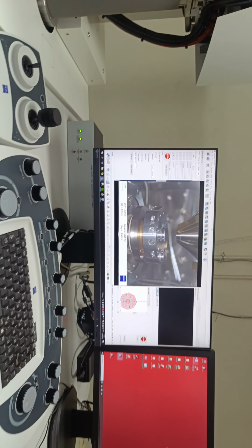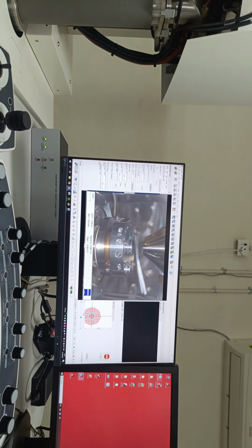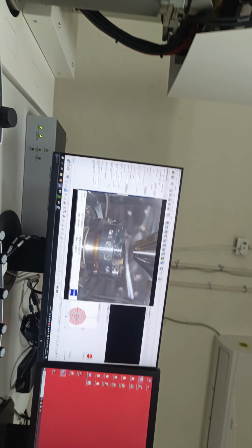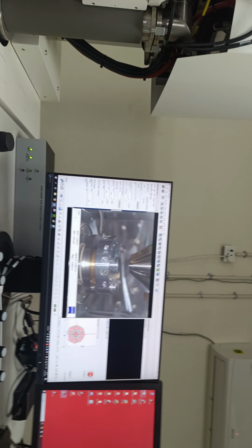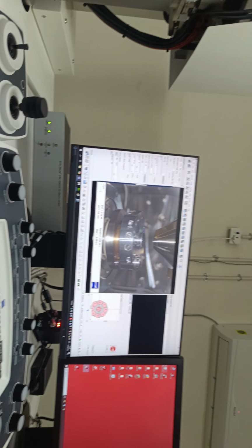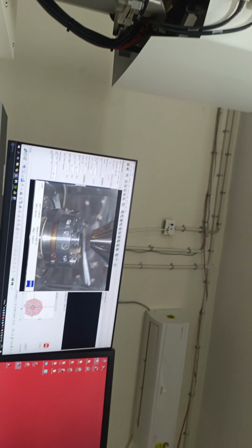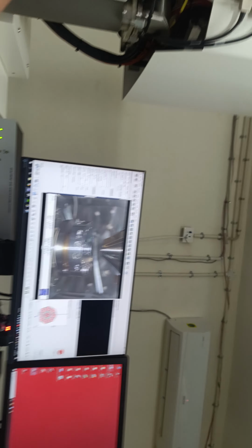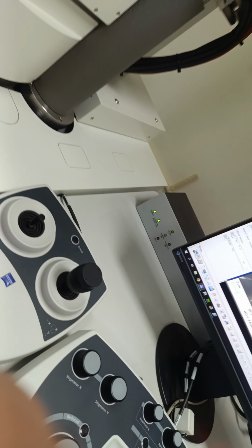Now I can go to the imaging. I'll try to show how the imaging can be done, just a few preliminary things so that you can be aware. So 5 kV is okay for me, I suppose, and you can disperse it as per your wish.